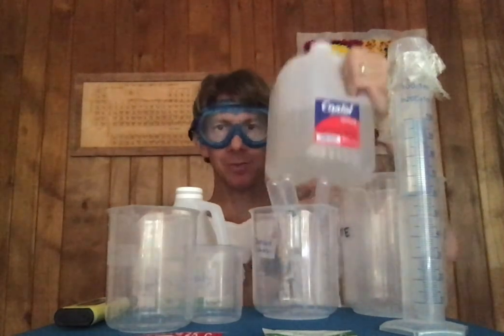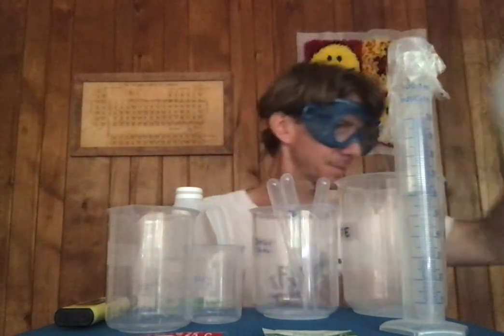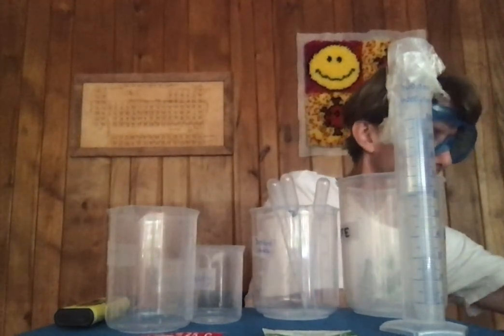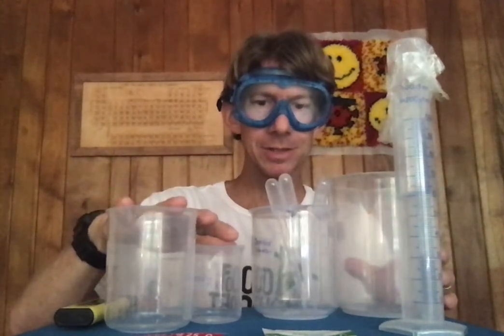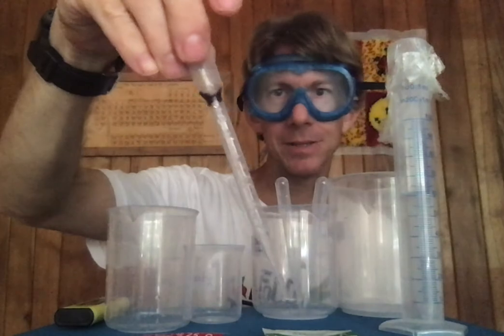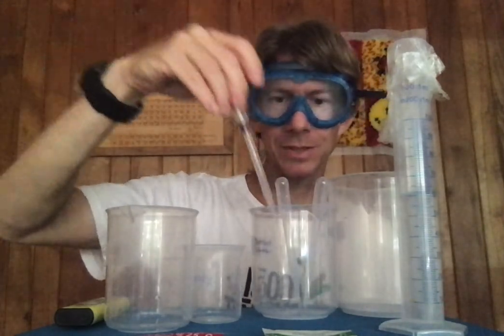So I have my distilled water. Set it over the side. I have my distilled white vinegar. I also have all of my beakers. I have my calibrated plastic pipette, the one from experiment two.